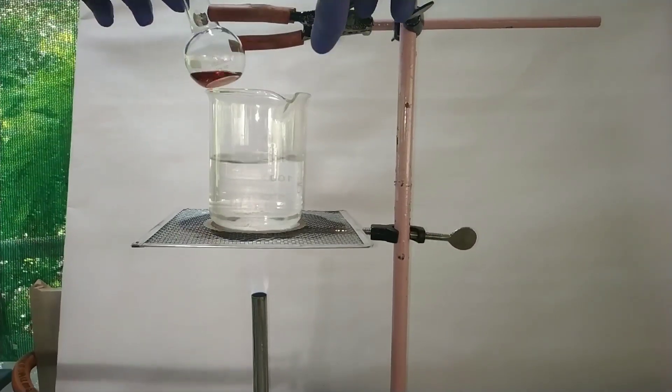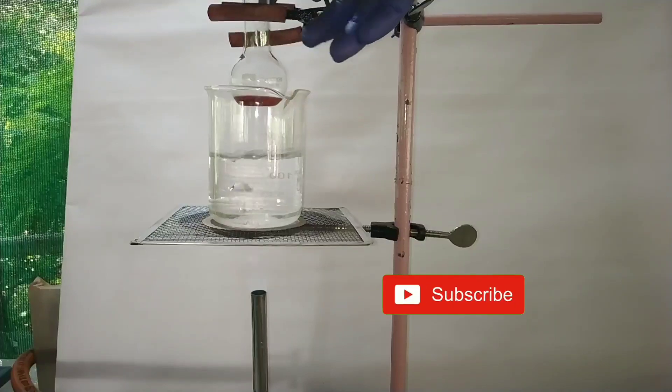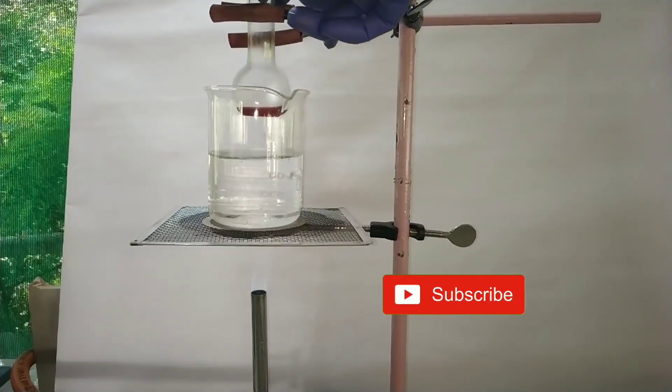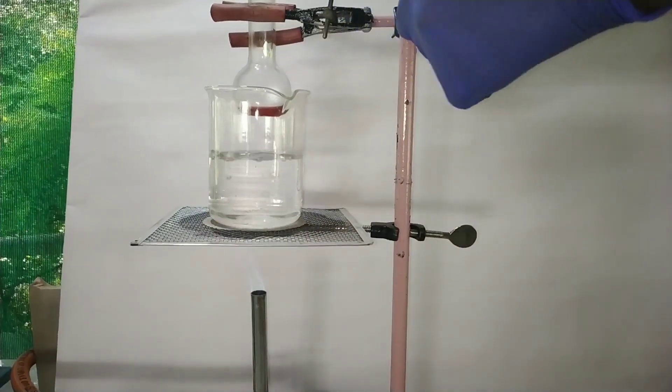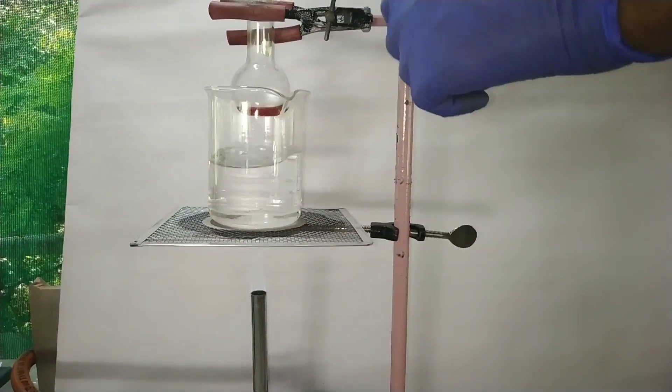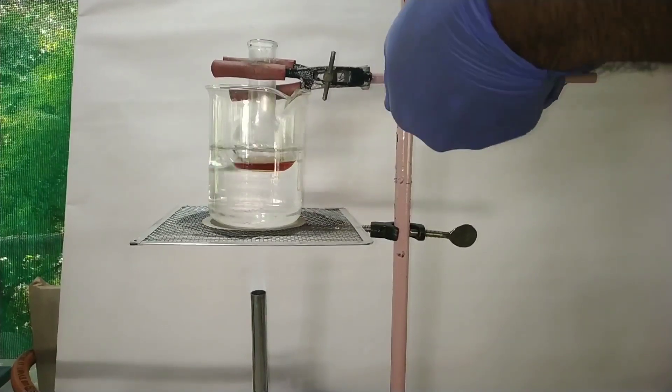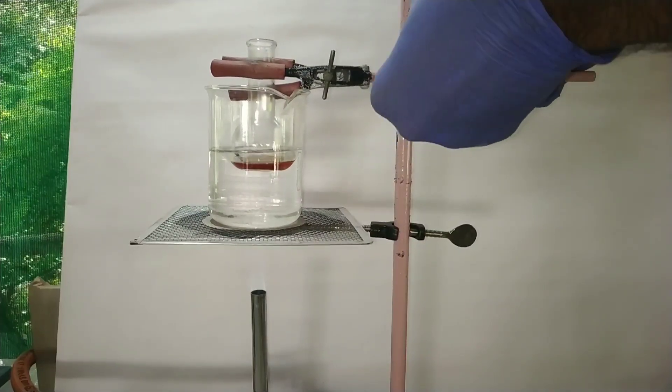After adding all these together we heat it in a boiling water bath for 5 minutes. I have clamped the flat bottom flask into a 250 ml beaker containing boiling water. Two reasons for not directly heating the compound is that one, it is an organic compound and they are flammable. The second reason is that the boiling water bath can provide us with a constant temperature.